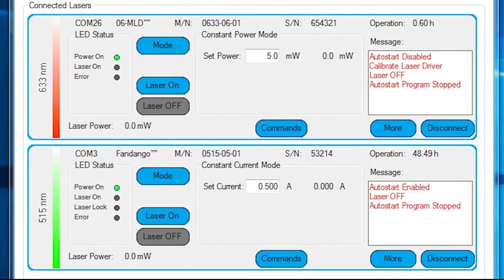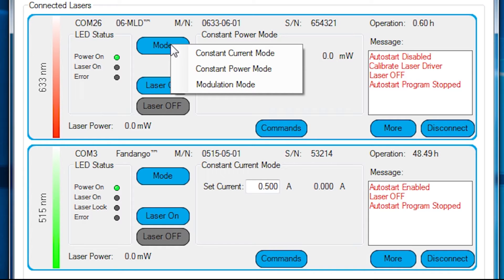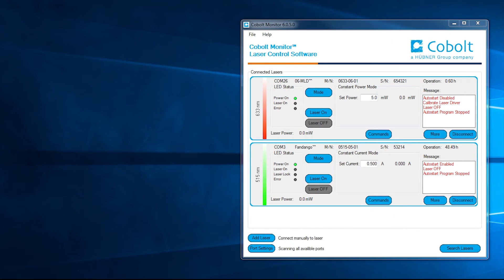The opening window at the top level shows the mode of operation the laser is set to. The laser can be operated in constant power mode, constant current, and in modulation mode. There are three types of modulation mode: digital, analog, and remote on-off, and all three can be used simultaneously in any combination.